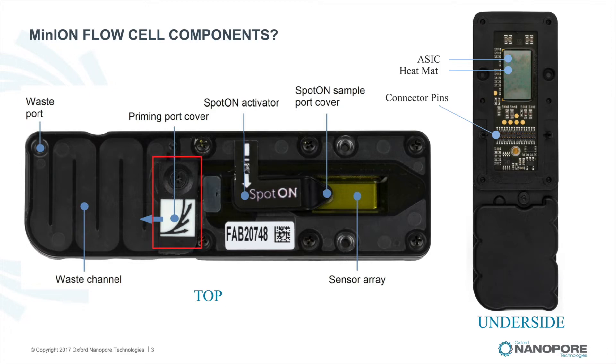The main feature on top of the flow cell includes the priming port cover, which has the priming port located underneath. It is open before the flow cell is flushed with priming mix. Opening the spot-on activator reveals the spot-on sample port. The sample port enables loading a sequencing library directly onto the sensor array.